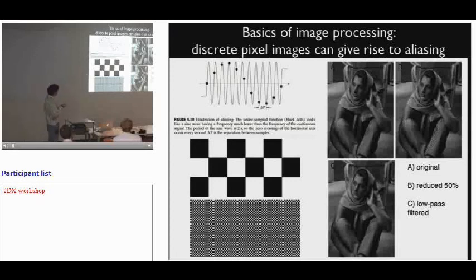All of this works pretty well in this checkerboard. Let's say each of these squares is a multiple of a pixel, 3 or 4 pixels, and you don't have any problems, so you can properly display your object. In the case here, it was chosen in such a way that each of these checkerboard squares has 0.47 pixels, and that, of course, will result in a new frequency, and this overlapping function here is what you see, an artifact of the system.